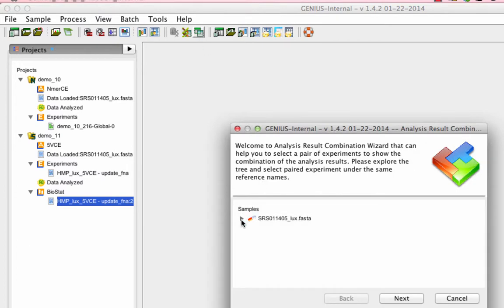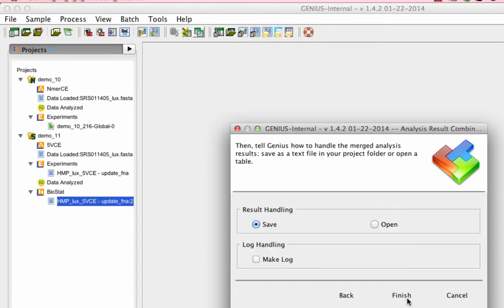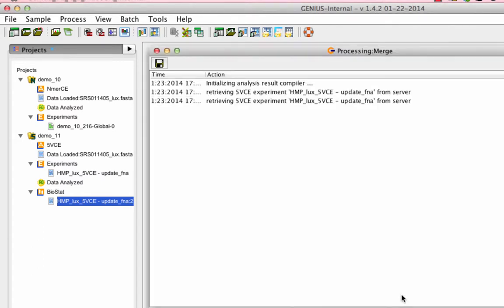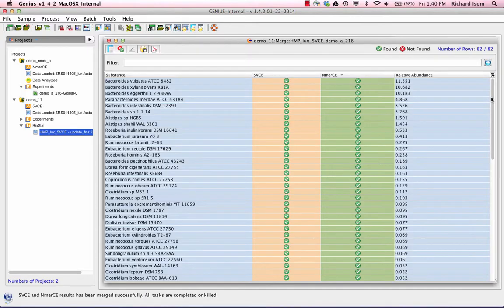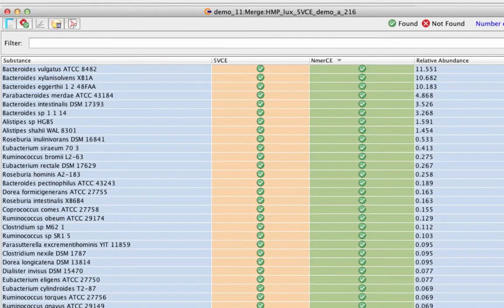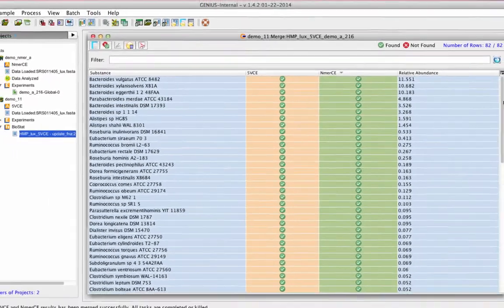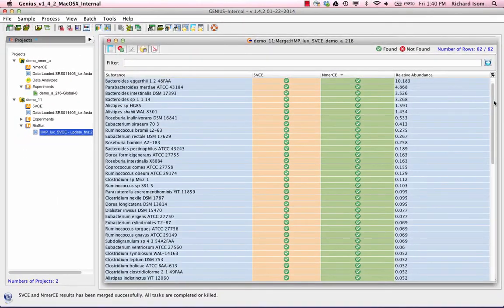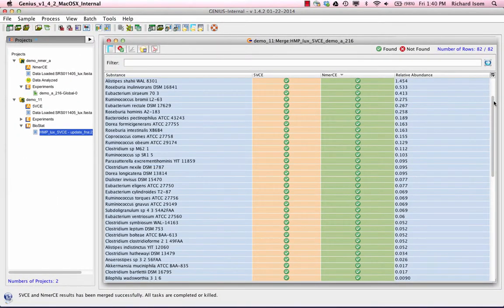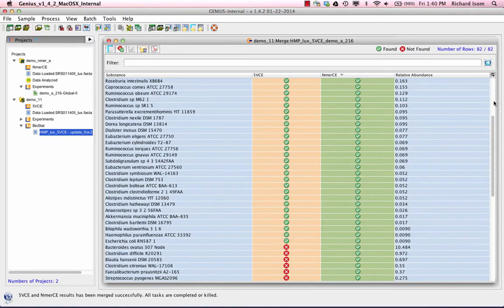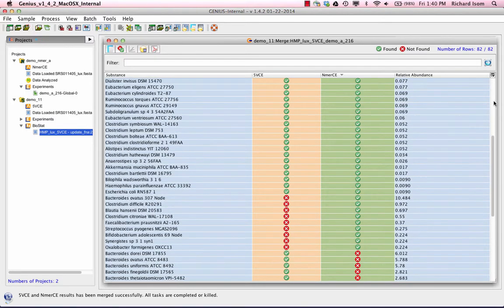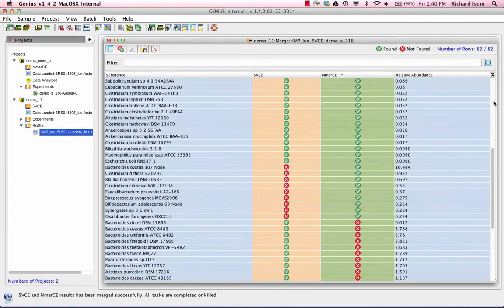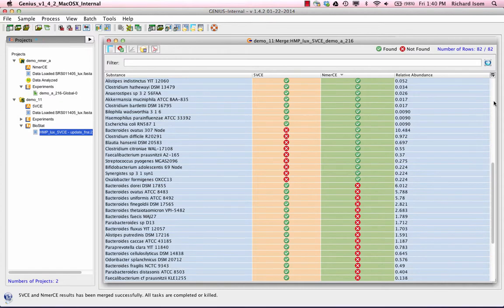Now that we have analyzed a single sample using our two independent algorithms with phylogenetic and statistical validation, Genius offers the opportunity to merge all of these validated results into one single file. This file shows the combined analysis in a simplified yet informative format. You can see that the majority of the species in the sample were identified by both of our algorithms, whereas a few minor species were identified by either 5VCE or NMRCE.